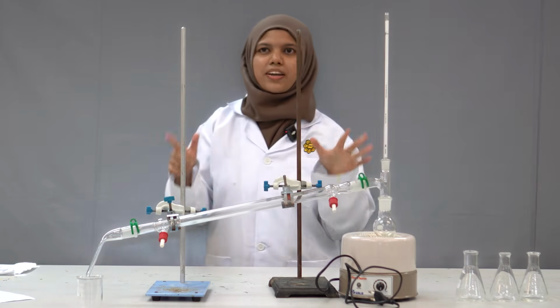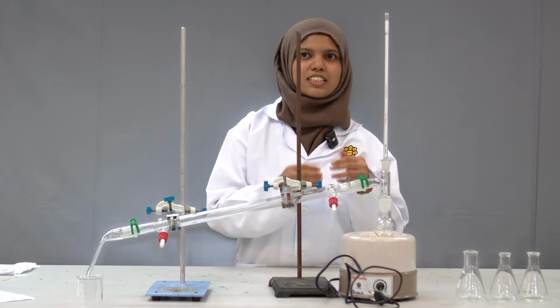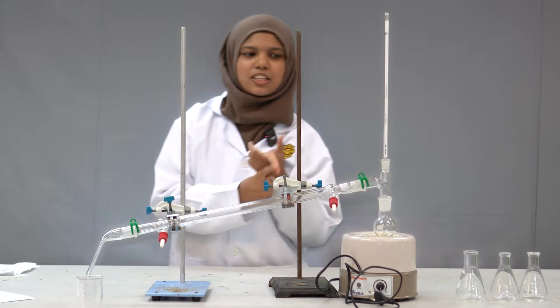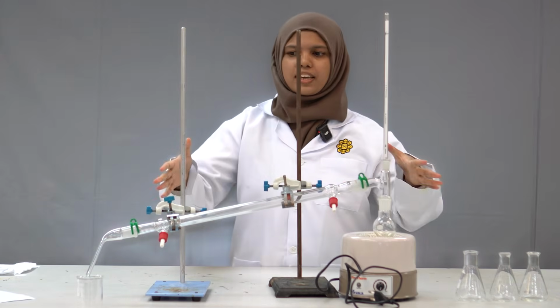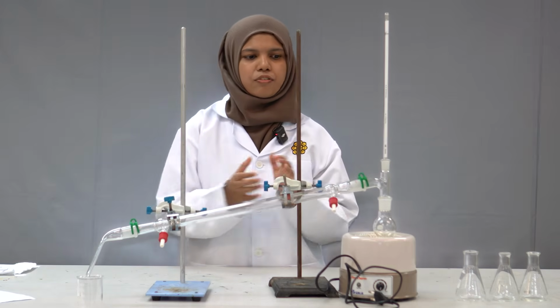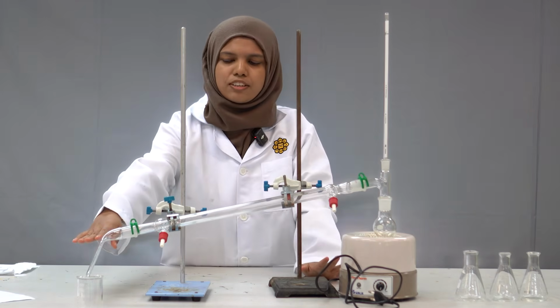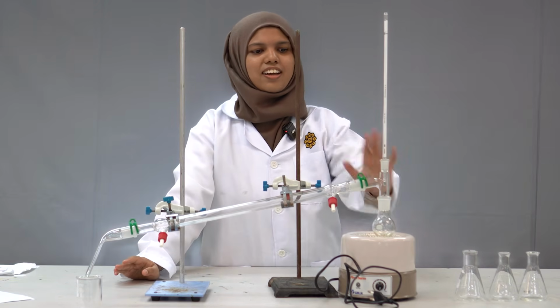There are 7 main apparatus that we need. First, the distillation process is widely used in industry and for lab purposes, because it is easy to understand and practicable. In front of me there are the 7 main apparatus of the distillation process: the heating method, distilling flask, condenser, receiving flask, thermometer, and distilling flask.